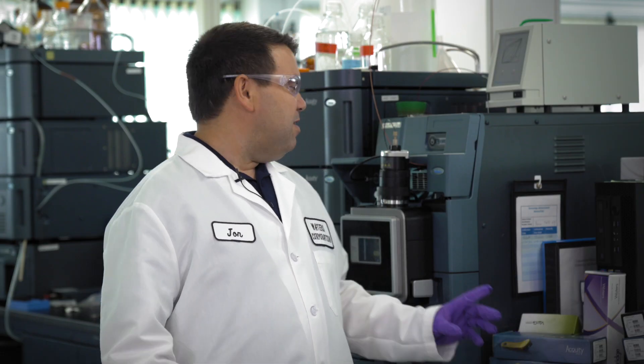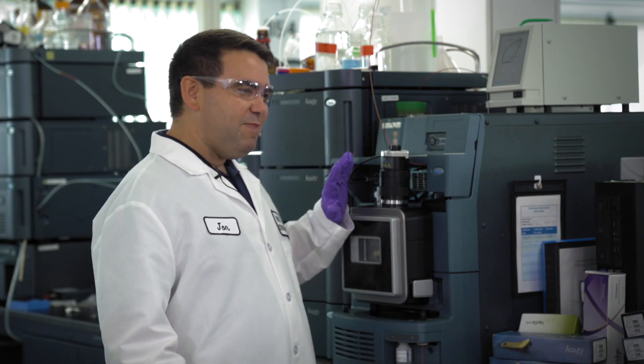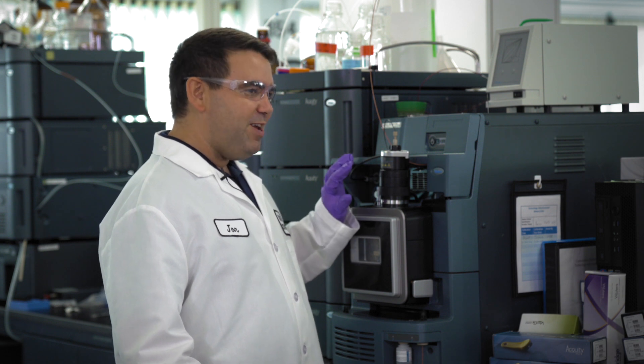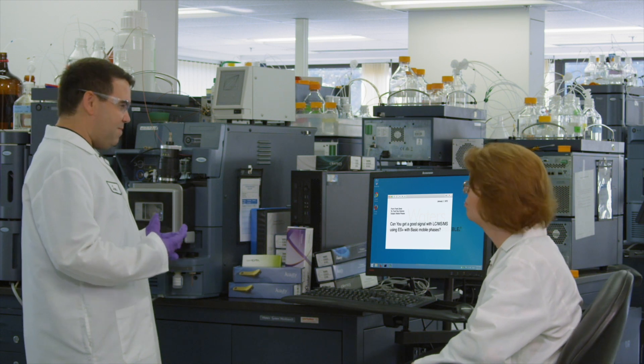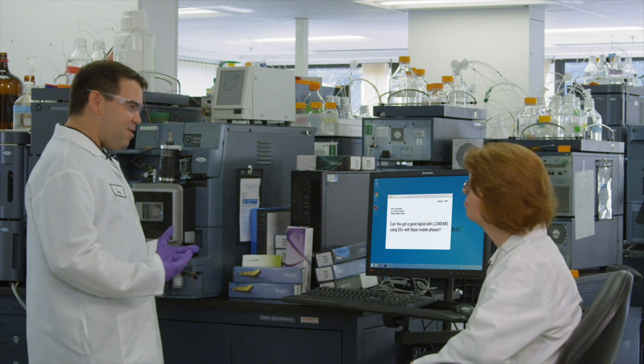It's kind of counterintuitive, but we do have a fancy mass spectrometer right here, all equipped and ready to go. So let's set this up — I'll get some columns, I'll make the solvents, and we'll run the experiments.